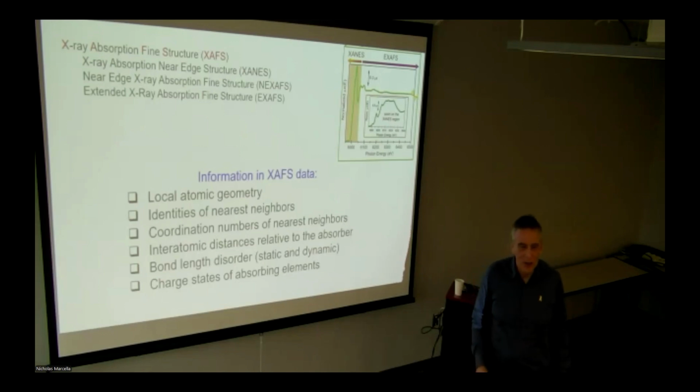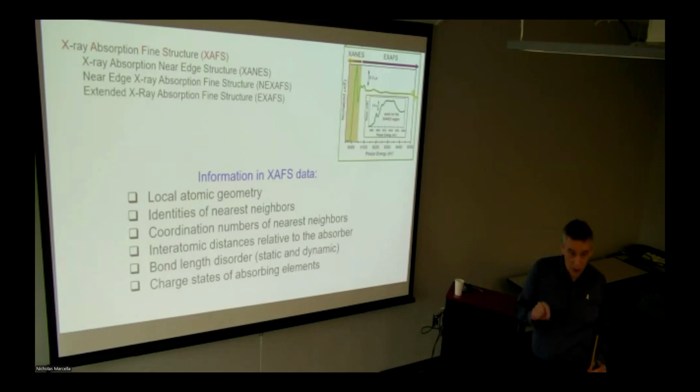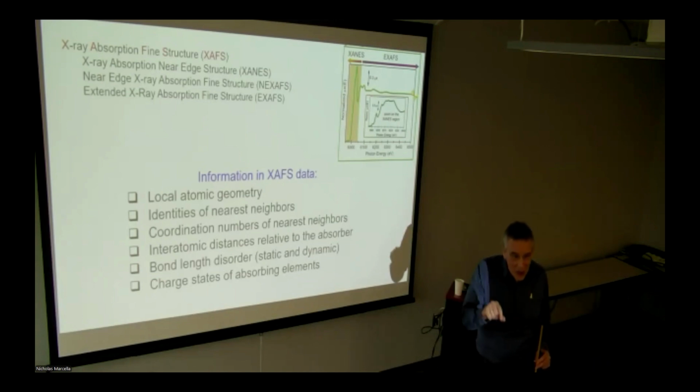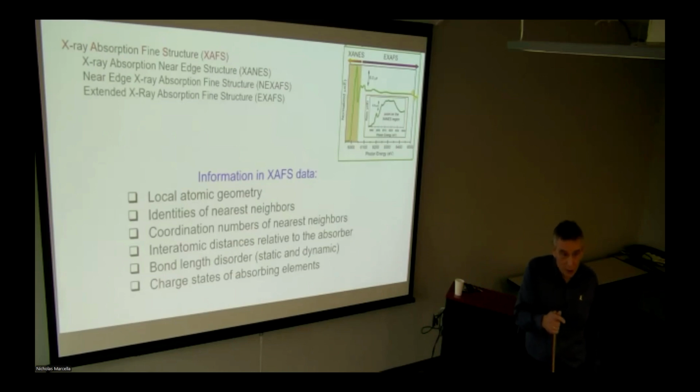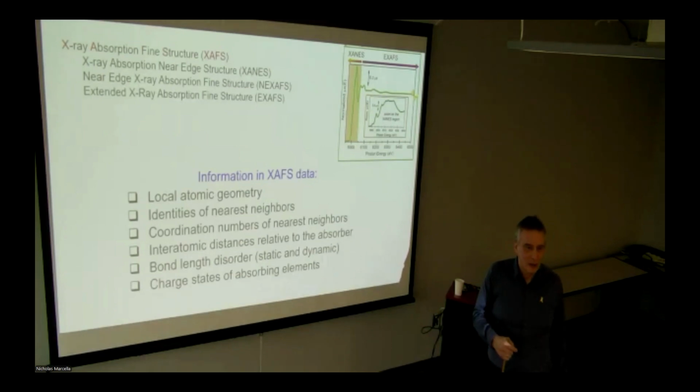Whether the energy of the X-ray, the electron you pick out with the X-rays, the energy it has is depending on the element, no? So you're only excited. If you're doing it from the palladium atom perspective, you always do it from the palladium atom perspective. But the difference is that in one case it's just a pure palladium nanoparticle, for example, in the other case it's a palladium gold alloy. But in both cases you're exciting a palladium core electron, so that does not change. But why will XAFS change when you measure it for the palladium edge, whether it's monometallic or bimetallic palladium? So you're suggesting that, of course, if we measure it from a different element, the absorption edge energy will be different, but we're measuring from the same element. You're not going to see the gold, right?